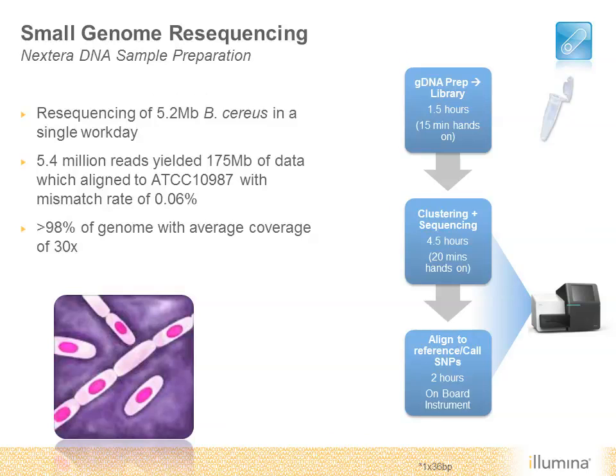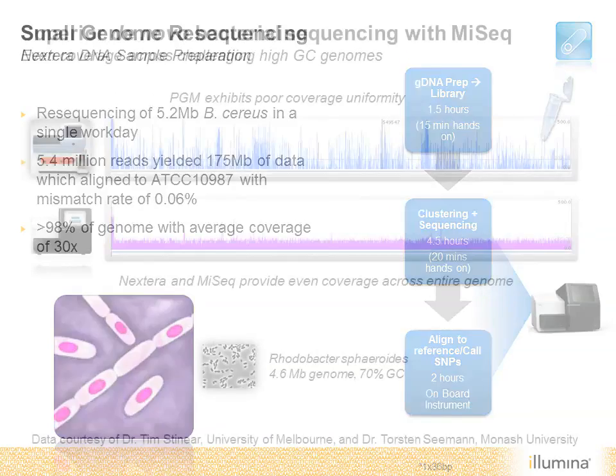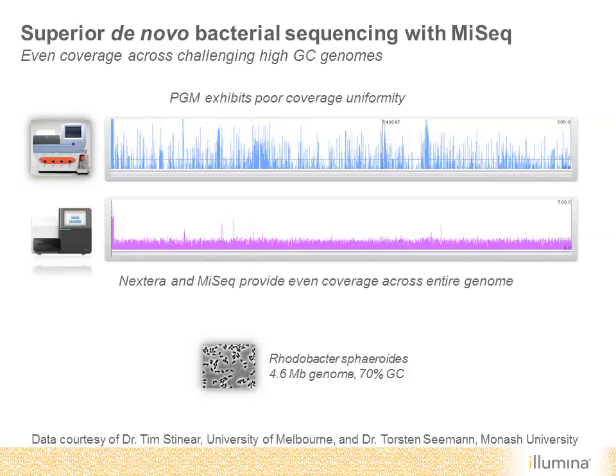Another example presented by Dr. Tim Sinear in a recent webinar highlights the excellent performance of Nextera and MiSeq for challenging genomes. They used Nextera and MiSeq to sequence the high GC genome of Rhodobacter. You can see the even coverage across the genome achieved with the MiSeq system, in stark contrast to the poor coverage uniformity from the Ion Torrent PGM. A recording of this webinar is available at Illumina.com if you'd like to listen to this comparison of the two benchtop systems in a bacterial research lab.